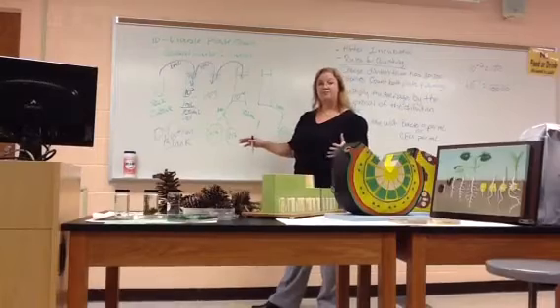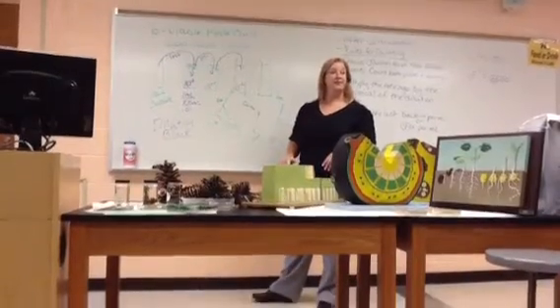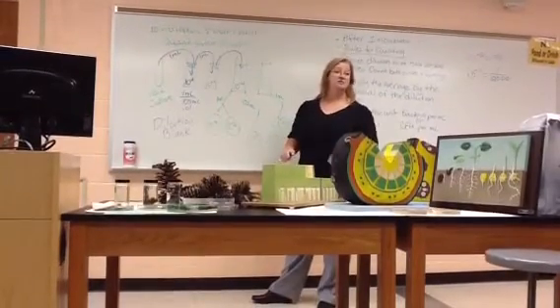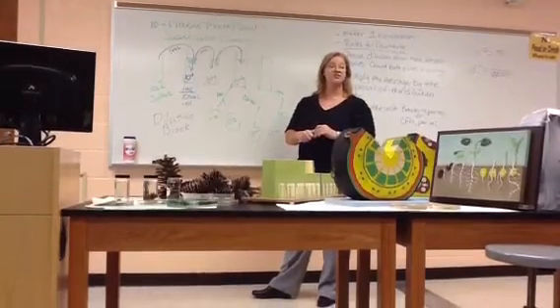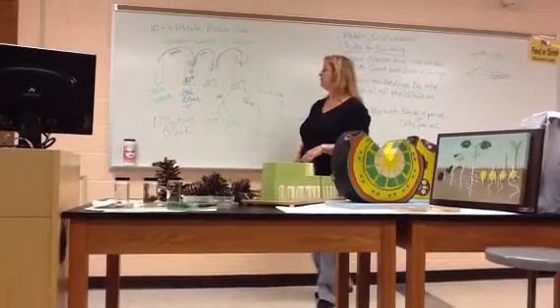Spread out the liquid, you're just pipetting the ml on, spread it out, and then stick both of those in the incubator. Now, we could have guessed wrong. There may still be too many bacteria in here to see isolated colonies. They may cover the whole surface like your tube 1, right? You wouldn't want to try and count every single dot on your tube 1 Petri dish. That may be what happens here. So we're going to dilute it further.